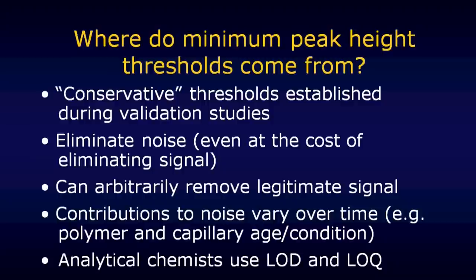distinguish between signal and noise at a particular point in time, and that reliability, that ability to distinguish between signal and noise, may well change over time. The instruments may get older and more prone to noise. The instruments may get older and less prone to noise. The reagents that are being used might be more or less prone to noise over time. The analysts using the instruments may cause them to be more noisy as they get lackadaisical with time, or less noisy as they become more proficient in the use of the equipment and the instruments. Those things can change.